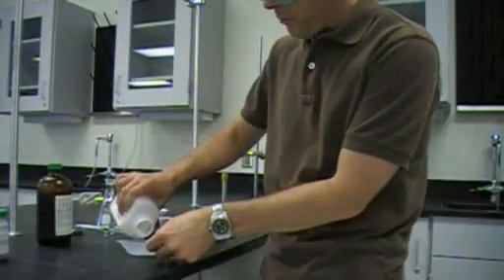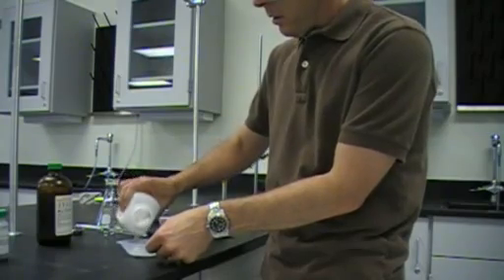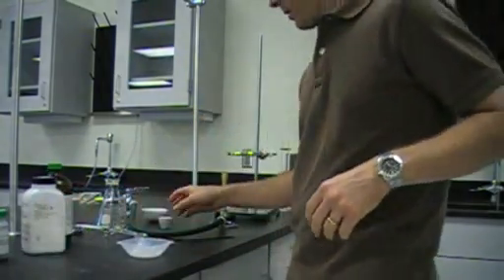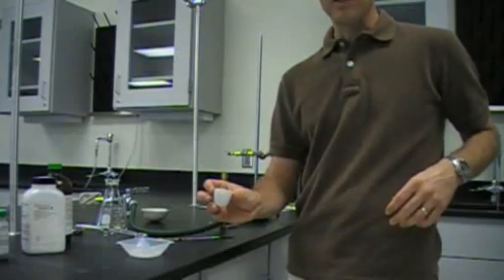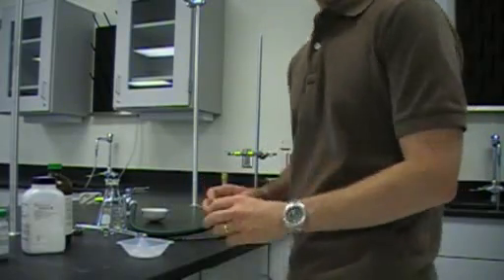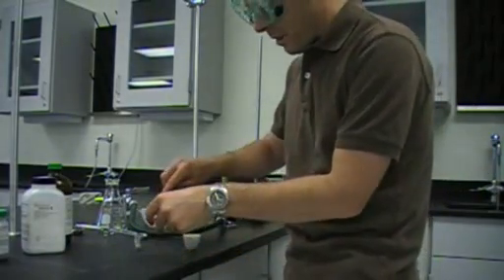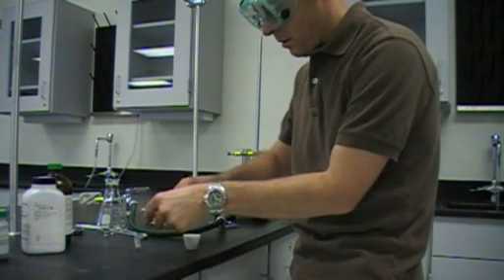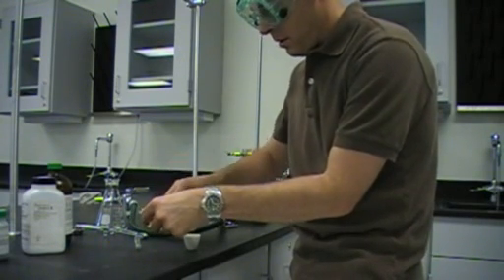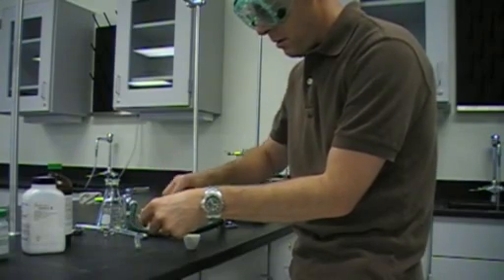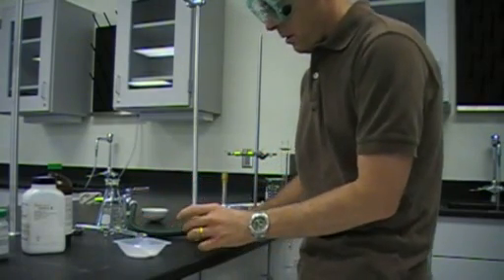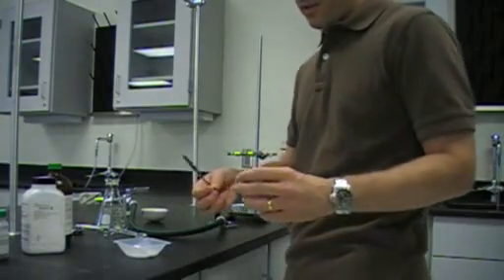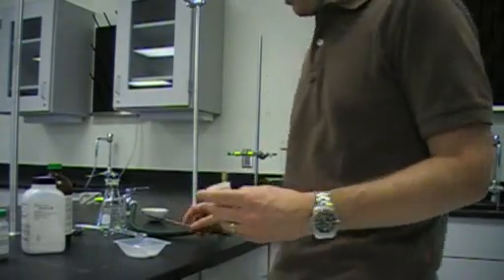So the first thing I'm going to do is get some chemical. And on a typical lab day, this would be done for you. And essentially, the next piece of equipment we're going to look at is this. It is a crucible. And I am just going to get some chemical into the crucible. And this is just a spatula. This is one way we can get chemicals, transfer chemicals from one place to another.